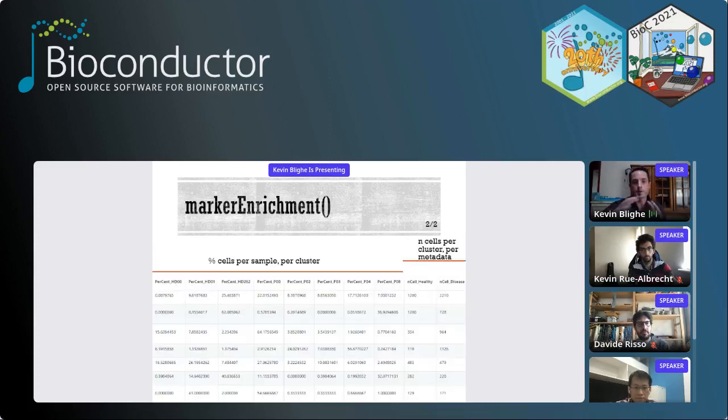And so this is the other part of that table. I couldn't fit it all in one slide. Basically, this is the metacluster abundance. So you see it outputs the percentage of cells per sample per cluster, and that's useful information. For example, you don't want a situation where one cluster is just dominated by 90% or 100% of an individual sample. You may rather want an even spread of the cells across all clusters.